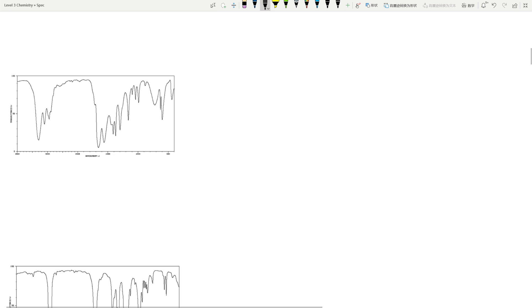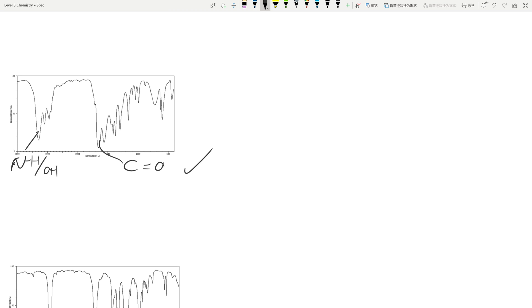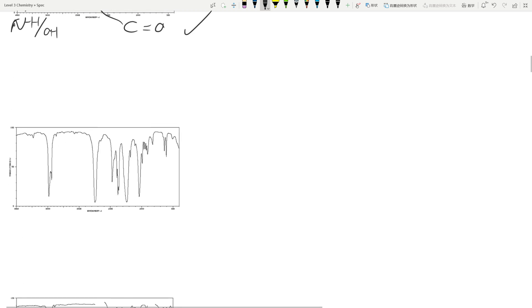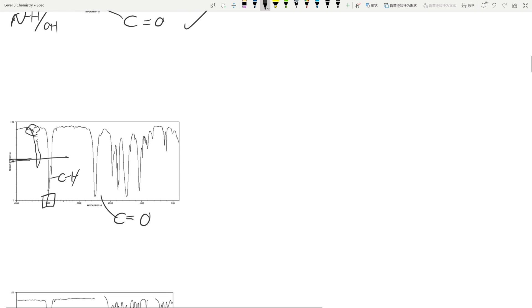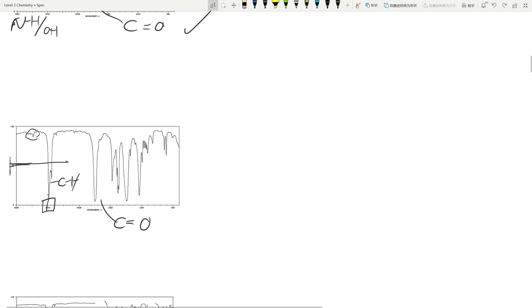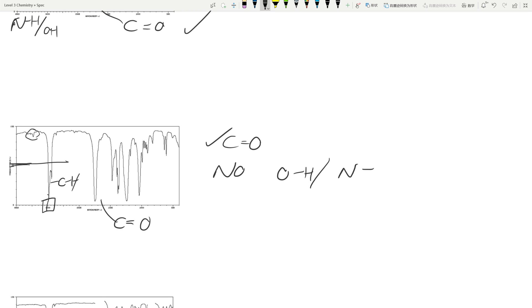This next spectrum again shows a C=O double bond, and this is your NH — most likely NH as it's quite sharp — and OH. This is your CH, which I don't really care about. This next one also has a C double bond O, and this is just a CH because it's right on 3,000. Don't look at this and ask if it's NH or OH — that's nothing. The 50% threshold, give or take. So you can say this has C=O yes, and no OH or NH. This is like solving a crime — putting all the puzzles together, using all the clues to figure out who the bad guy is.